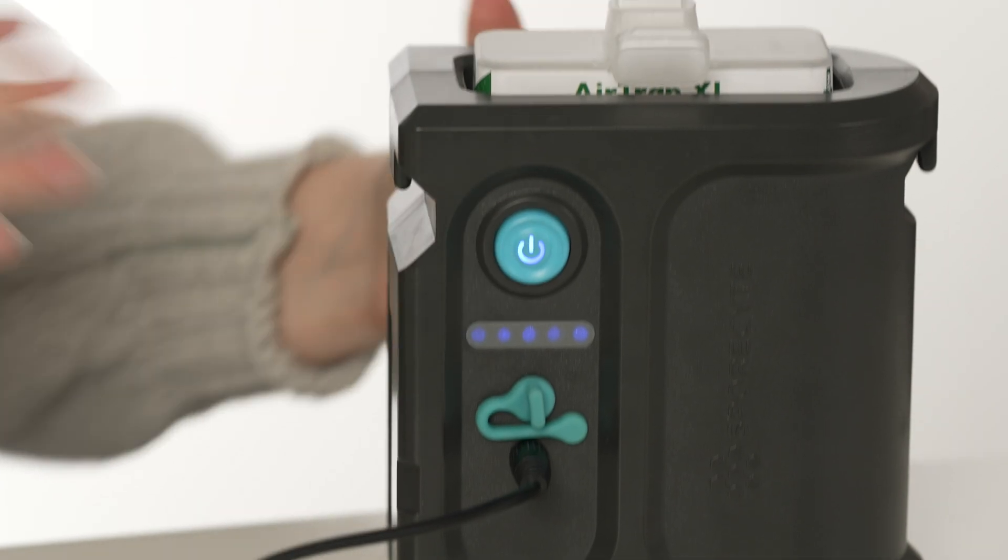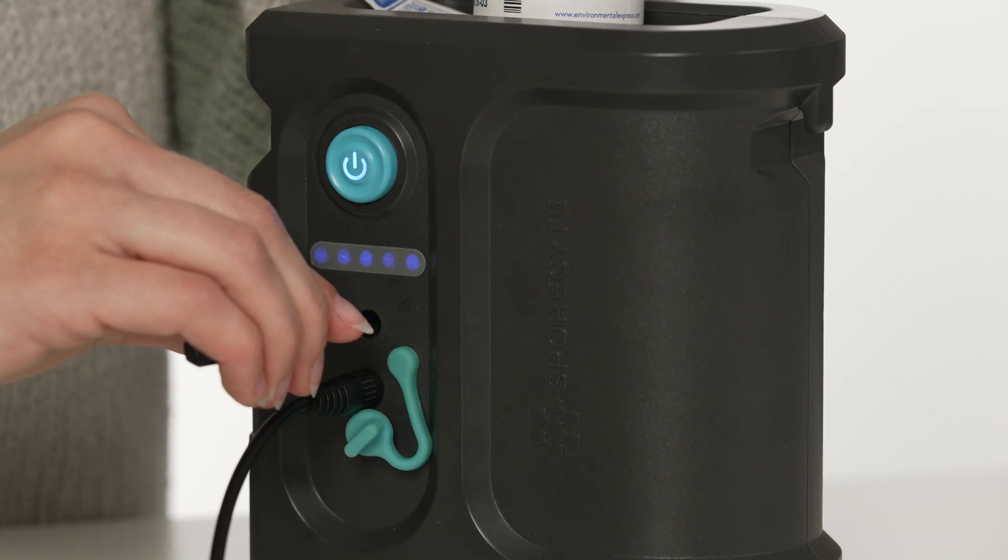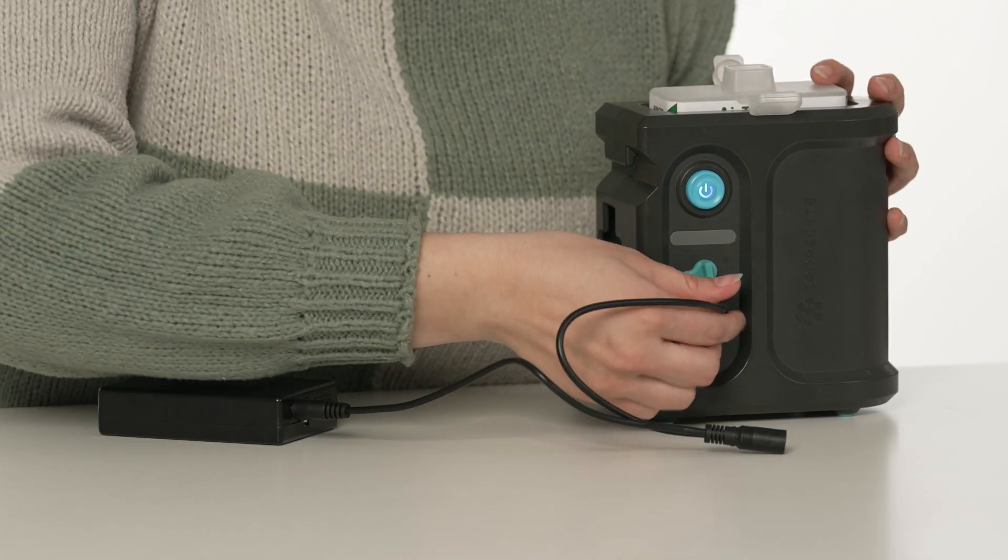Welcome to the Sporecyte Professional Air Sampling Pump Calibration Guide. In this tutorial, we'll learn how to calibrate your Sporecyte pump for accurate air sampling.